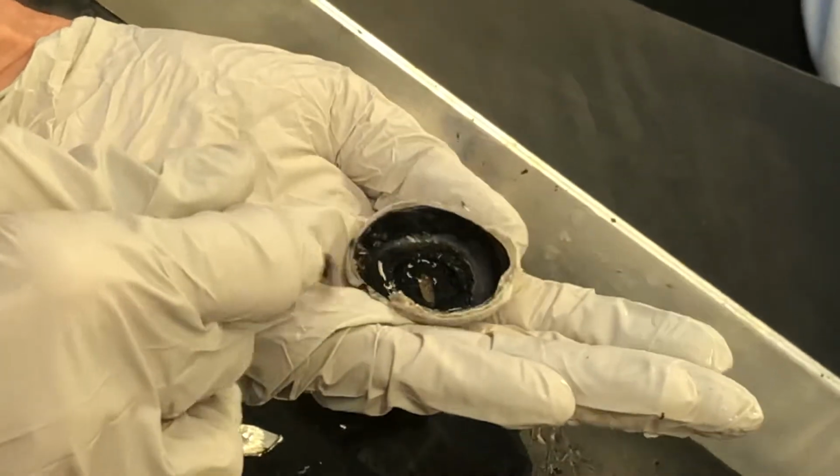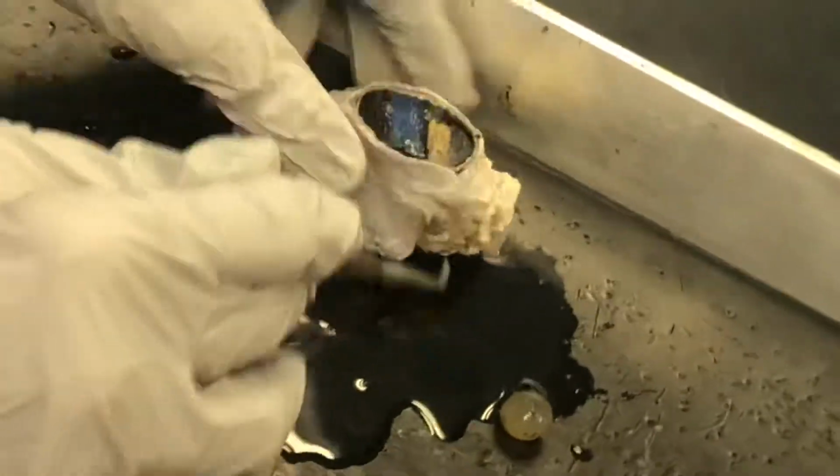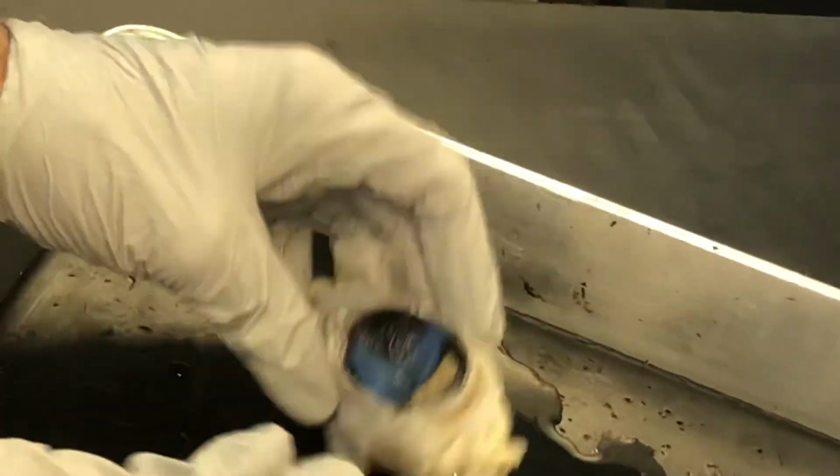And this little bit of stuff here looks like vitreous humor. Let's see. Where is the vitreous humor? Where's the ball of jelly? Come on, we're cheated.